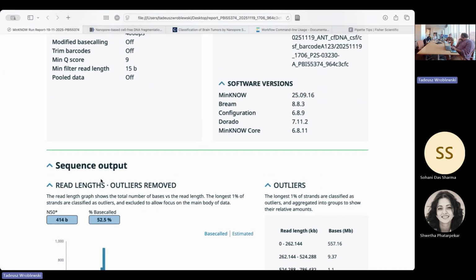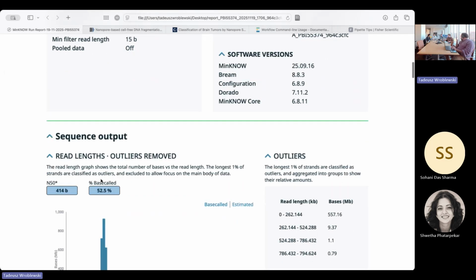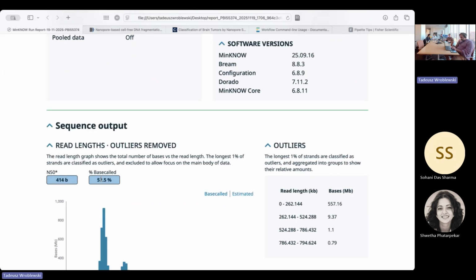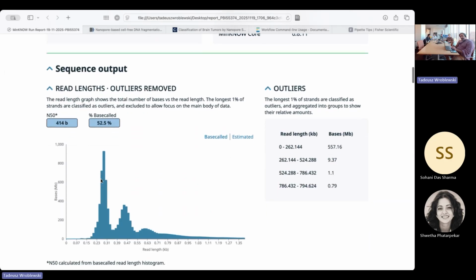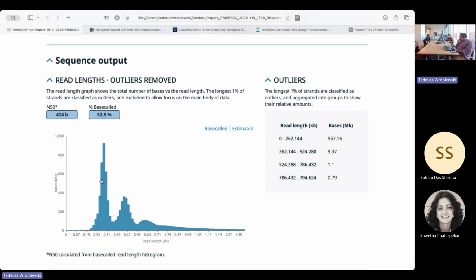However, we can basecall post hoc with methylation. So it sounds like we're not missing the methylation data, we just won't have real-time calling on it. Oh, there's a real-time part. Okay, fine. I was worried for a moment that we would not be able to do that. You can do it. And also, not all methylation calling can be done in real time.